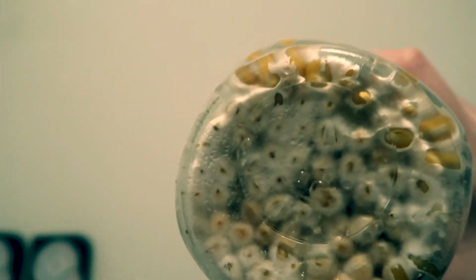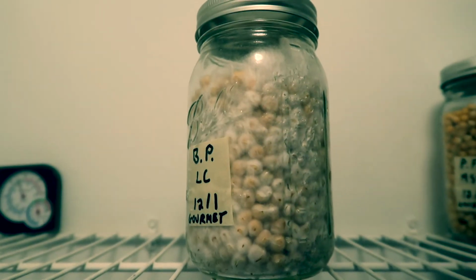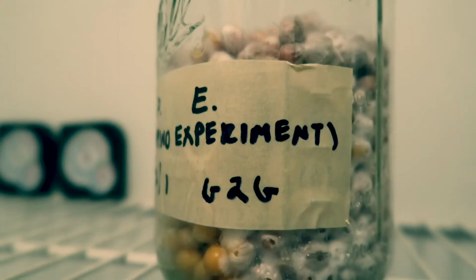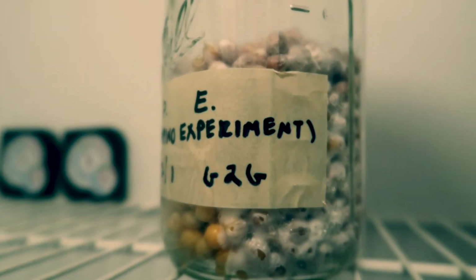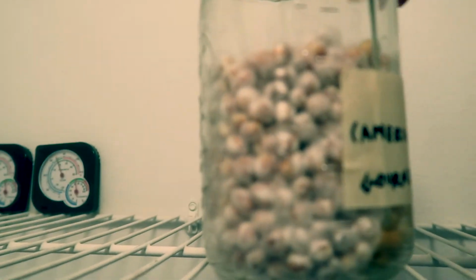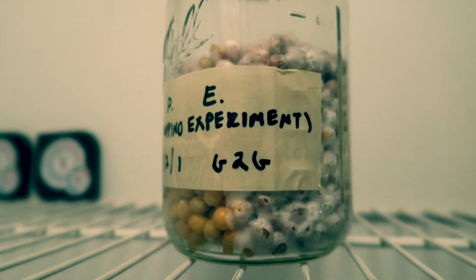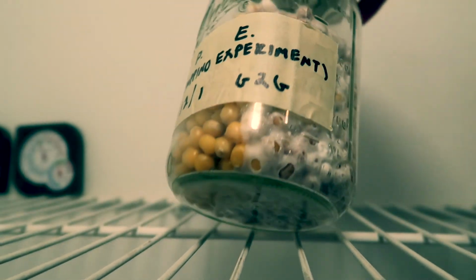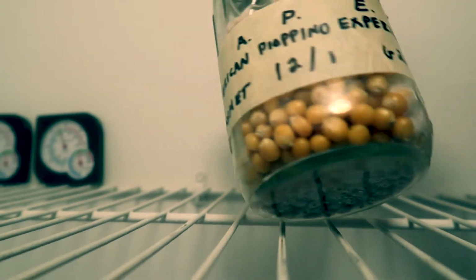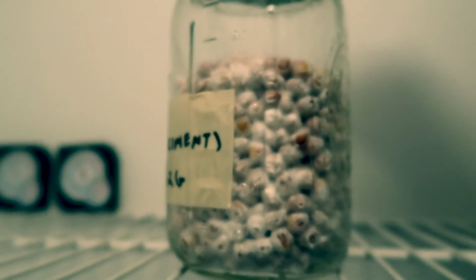Here's a look at the bottom of the jar. Everything is looking nice, fully colonized almost, ready for a break and shake. That was the liquid culture inoculation method number 1. Here is inoculation method number 2, which was a grain-to-grain transfer. Also the same thing. Even though this is less grain, it pretty much almost fully colonized this whole container as it is. And this would also benefit from a nice break and shake to really finish off this corner of colonization right here. And then this will also be good to spawn to a bulk substrate.